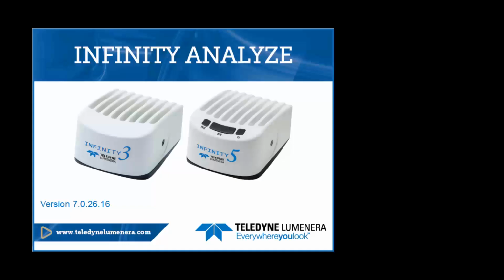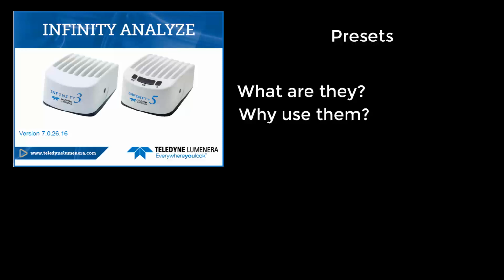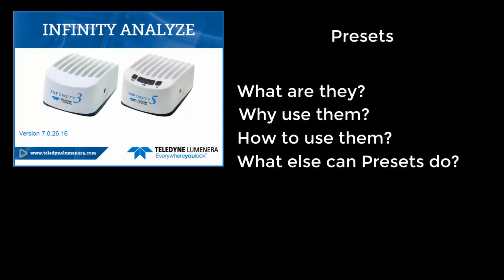In this Infinity Analyze 7 lesson, we'll take a look at presets. What are presets? Why do you need to use them? How do you use them? And what else can you do with presets?